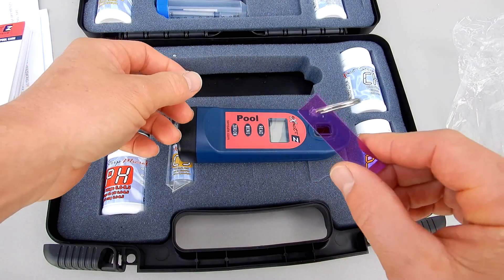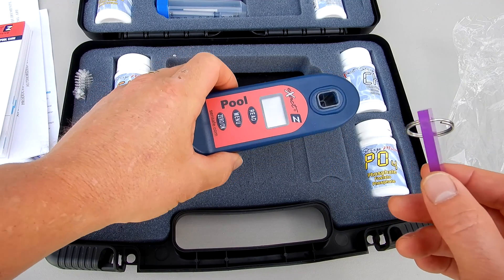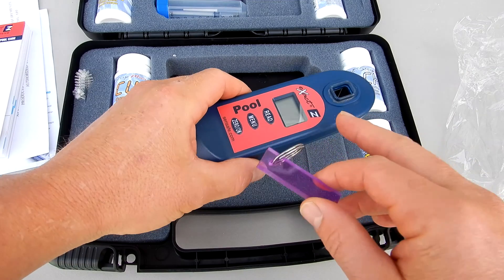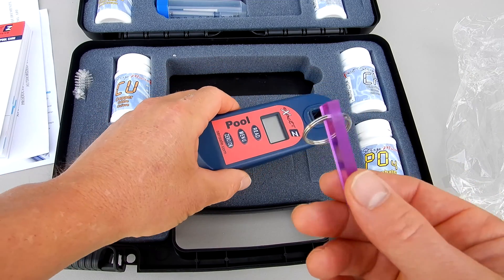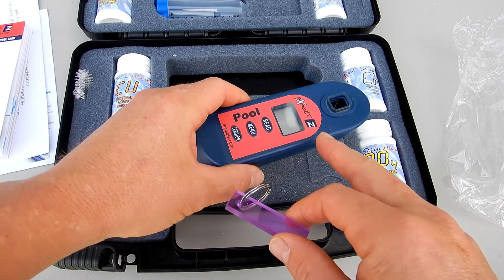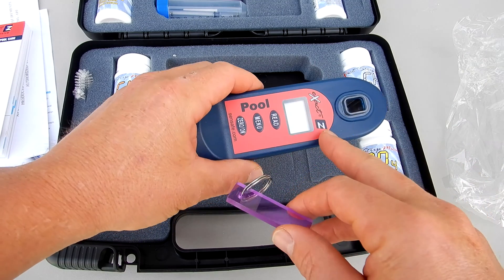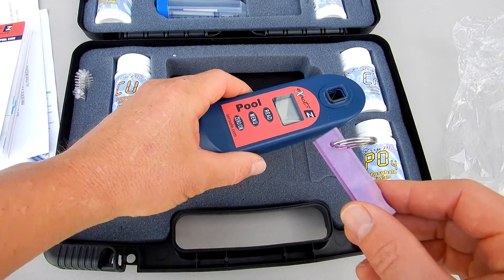Also included is this calibration key. This will verify that the POOL EXACT is calibrated from the factory and that the calibration is correct. This is not actually something that you can calibrate — these are all factory calibrated. This is just to verify that the POOL EXACT is operating correctly.